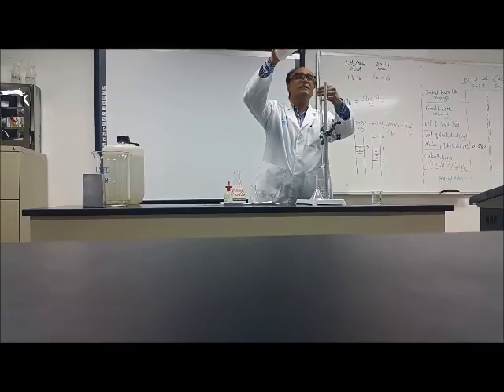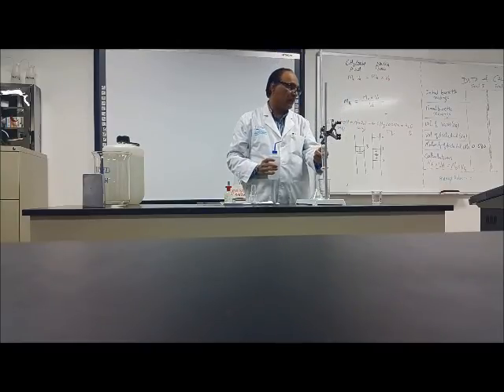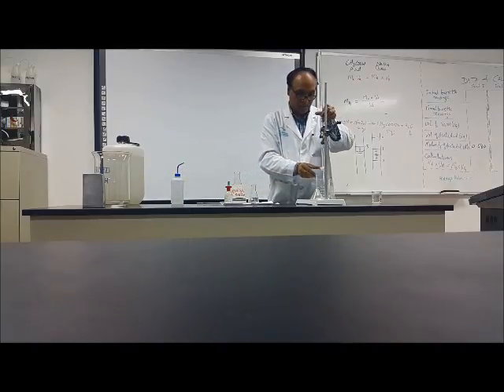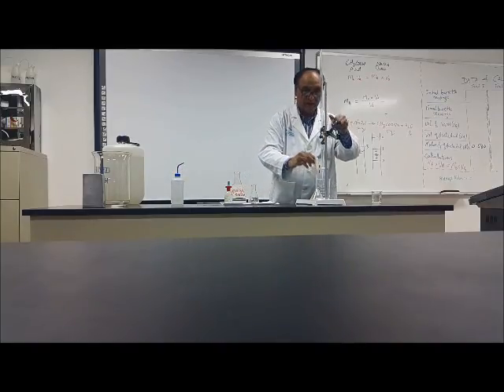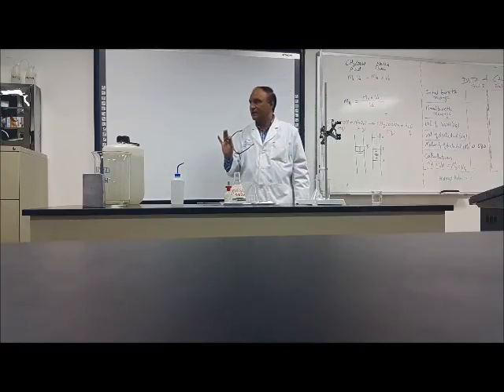You see this one? You move it and wash it with water. Don't put too much water. This is more than enough. Don't put too much. This is enough. And now you open it. So all the water will go down. Now it is washed with the distilled water.